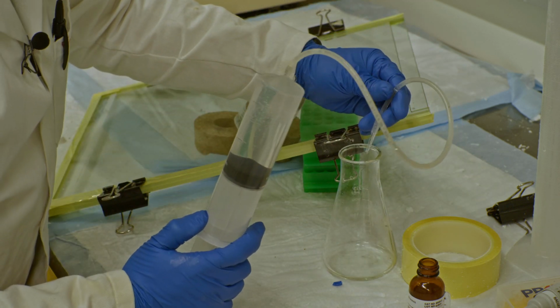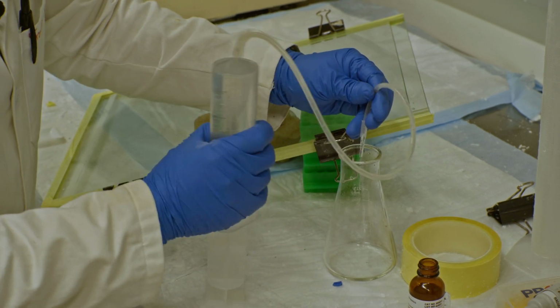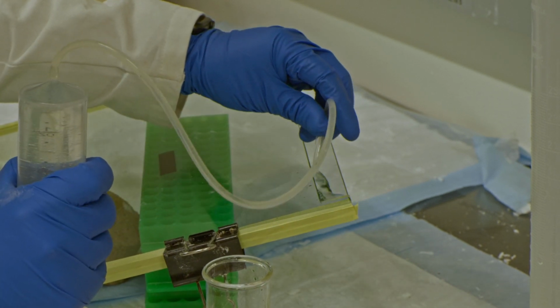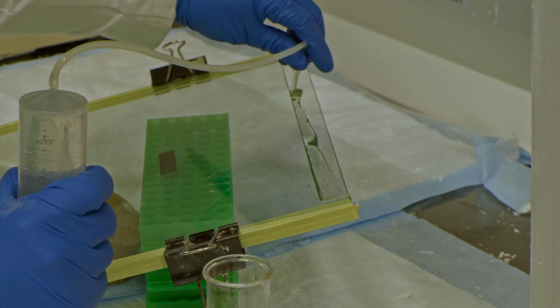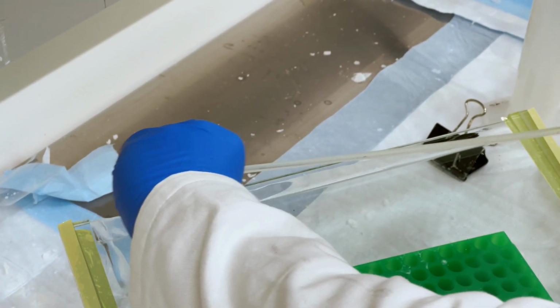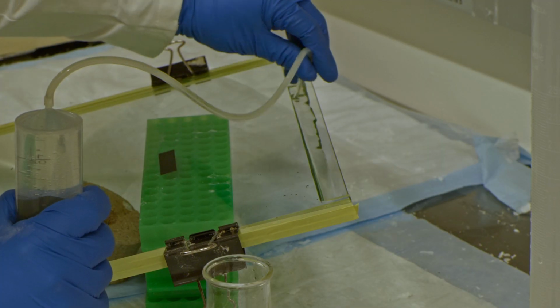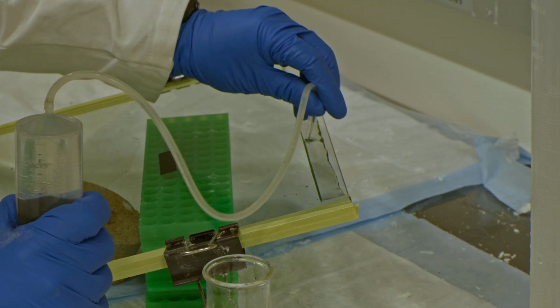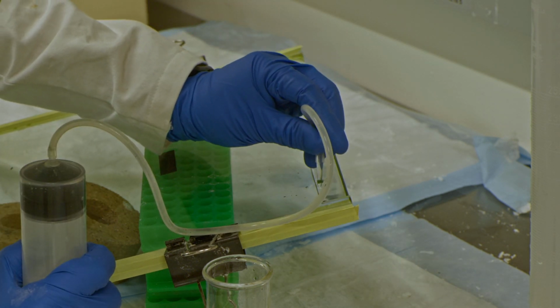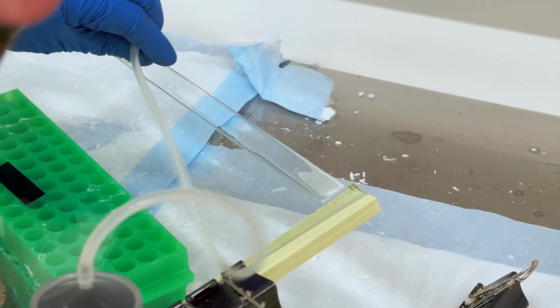So it looks good. No bubbles in the line. Good. Then start. The gel will polymerize quite quickly, so you want to get an even pour. Don't worry about any of the bubbles that form. They should come out right at the top.